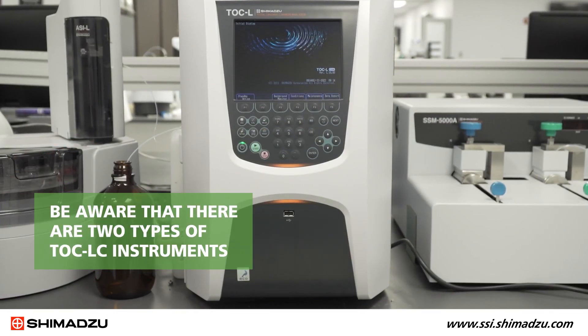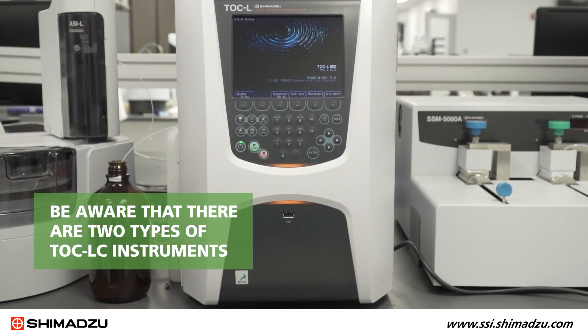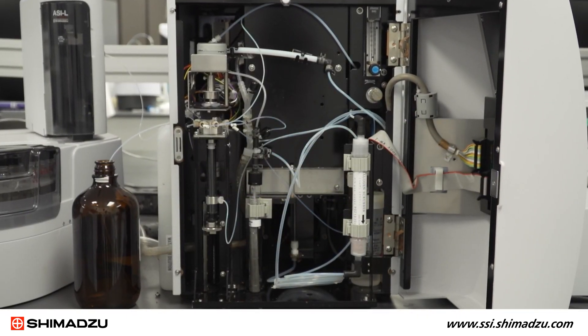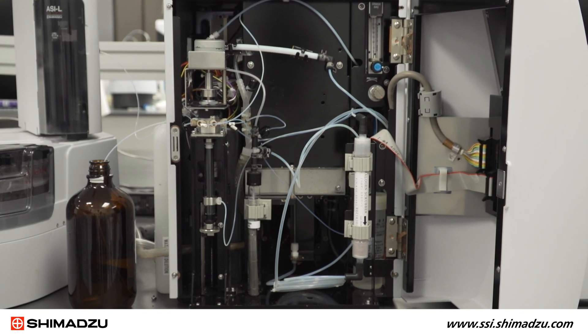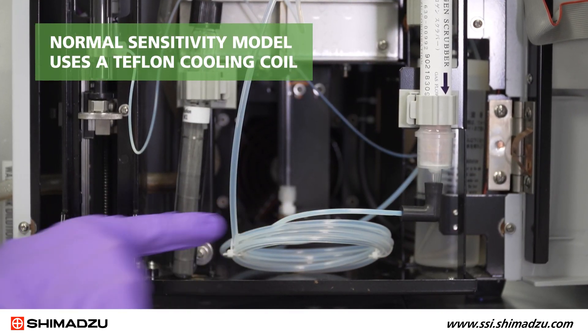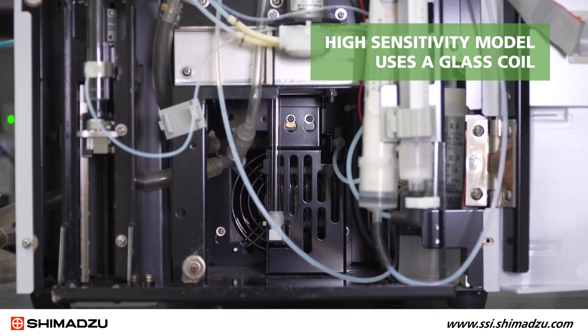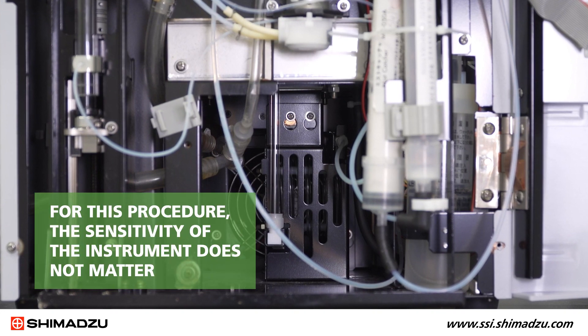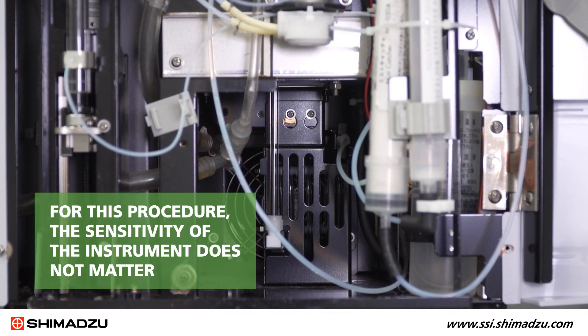Be aware that there are two types of TOC-LC instruments: a high-sensitivity model and a normal-sensitivity model. One of the ways they differ is the cooling coil at the bottom of the combustion tube. The normal-sensitivity model uses a Teflon cooling coil and the high-sensitivity model uses a glass coil in a protective metal casing. For this procedure, the sensitivity of the instrument does not matter.